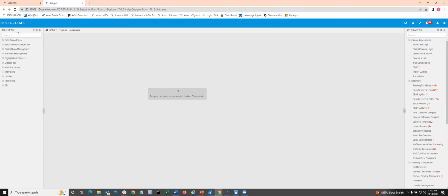So it's within the main menu, and it appears on the left-hand side of a STARLIMS system. And you can do a quick search for that once you guys have access, if you don't already, to the VM. And so there's our designer link.